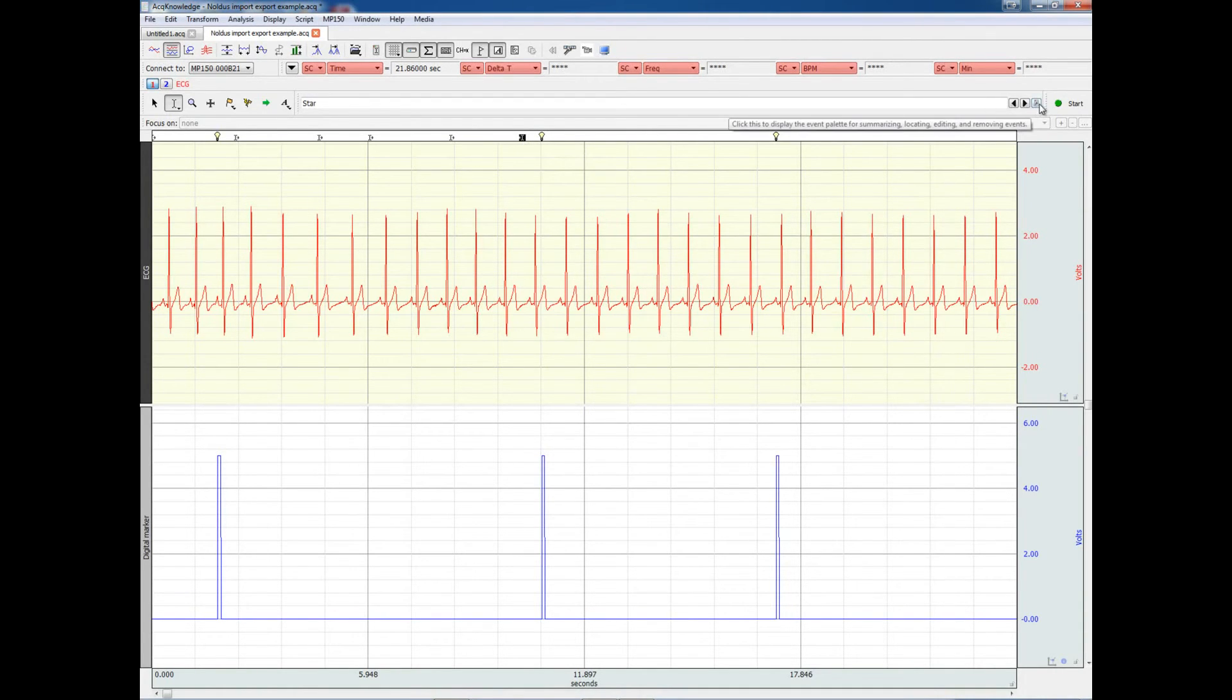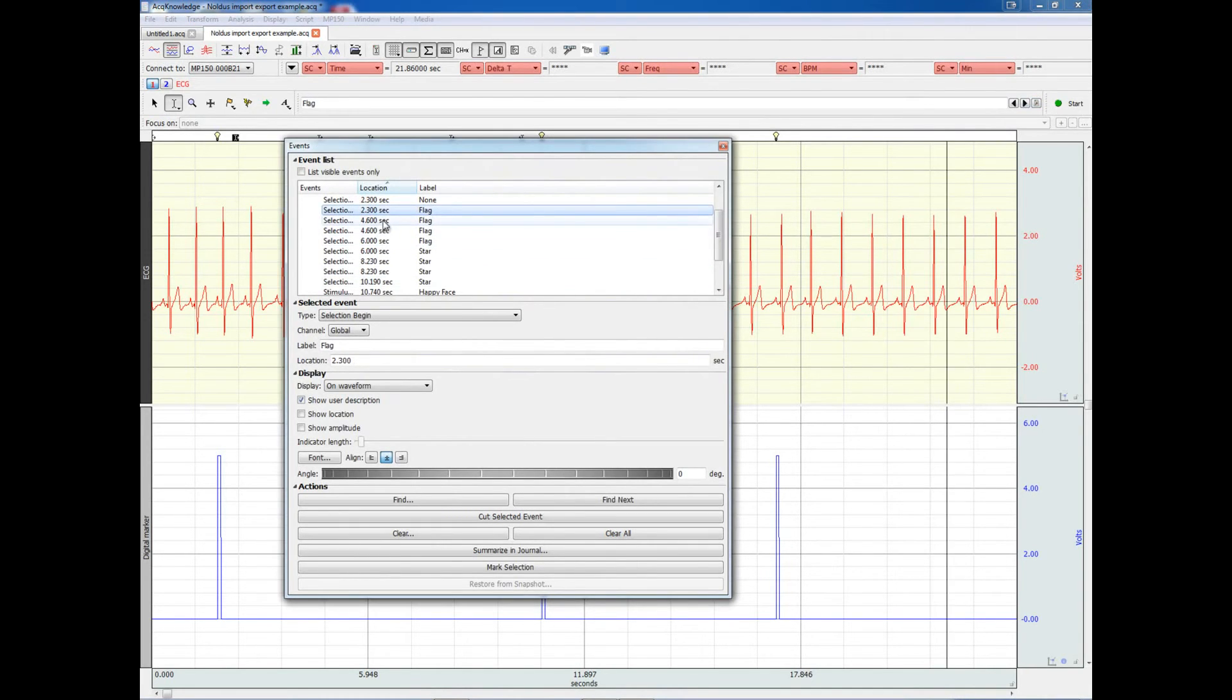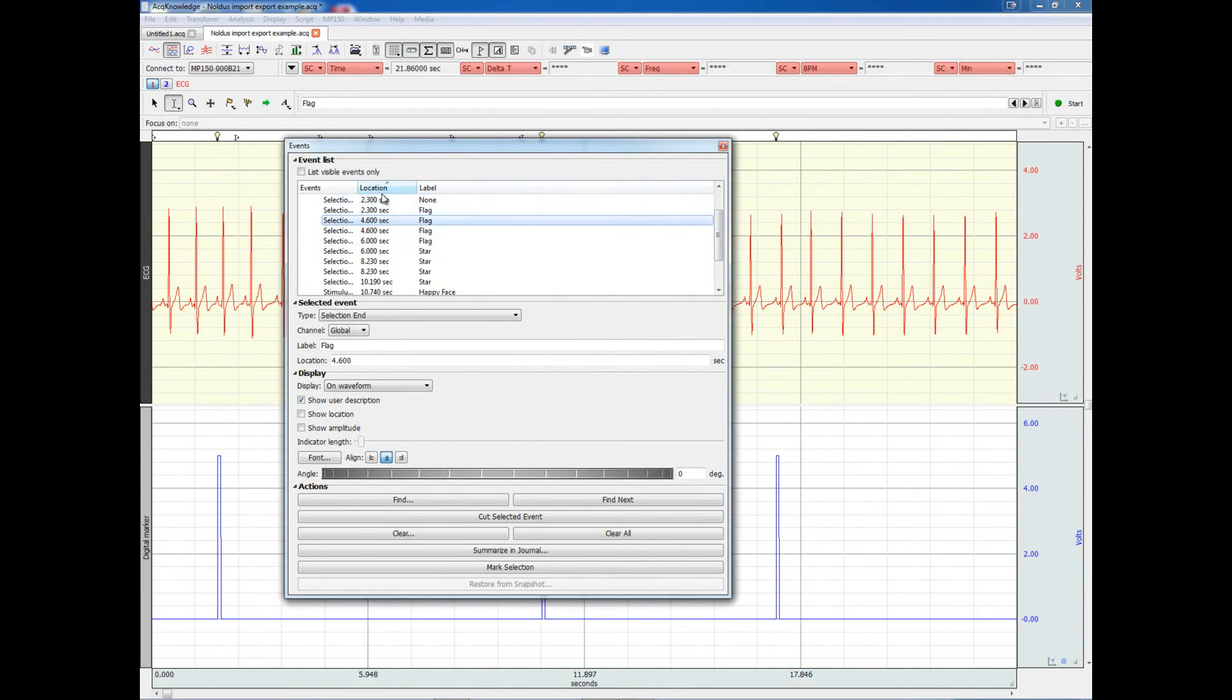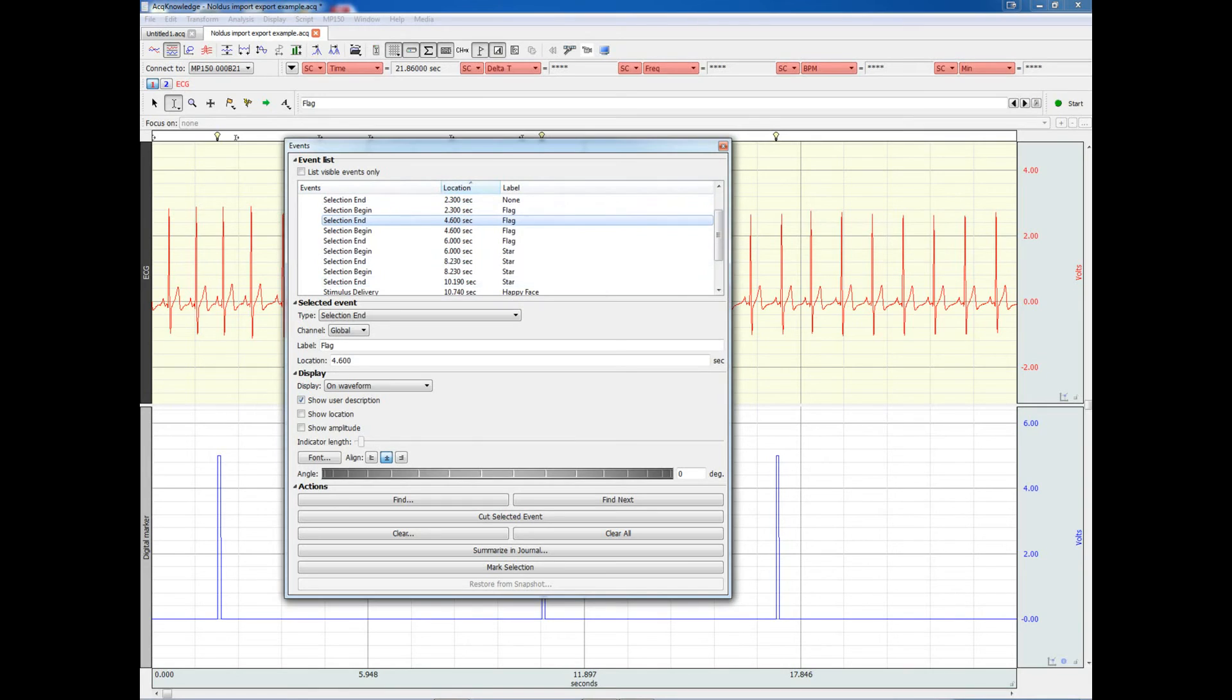We can browse the events by enabling the event palette, and we can, again, look at the time and the label of the different events, as well as, of course, the type of the event.